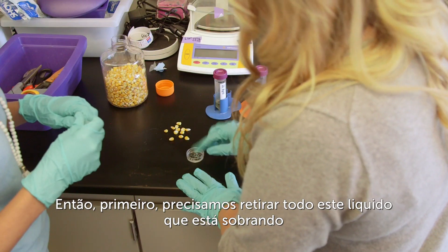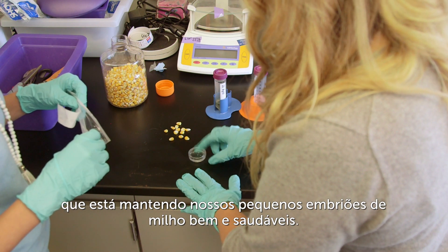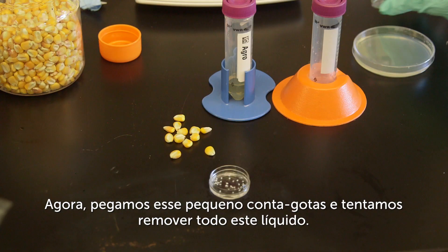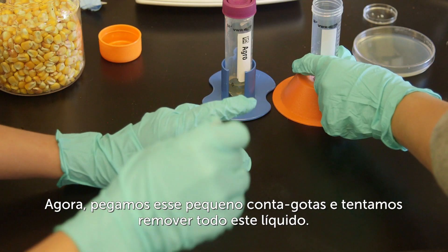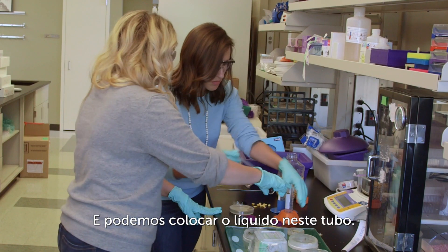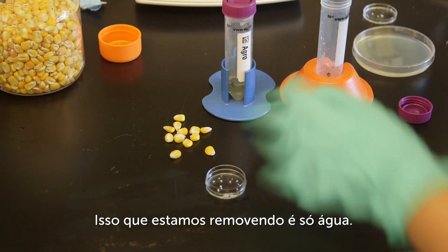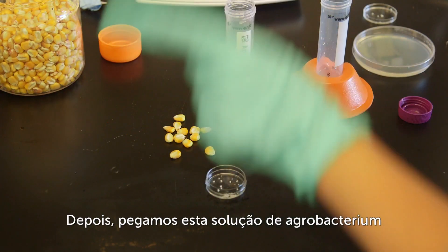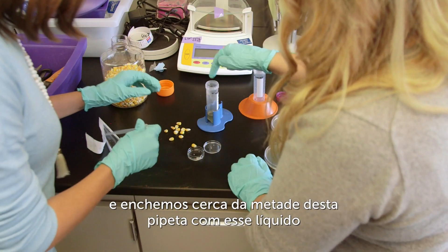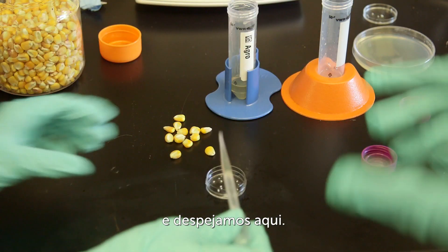First we need to take off all this extra liquid in the cell that's keeping these little corn embryos nice and plump. So you're going to take this little dropper and try to remove all this liquid and put it into this conical tube. This is just water that we're removing. Then you're just going to take this agrobacterium solution and drop about half of that pipette filled with that liquid and dump it in.